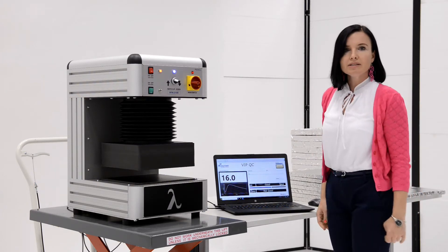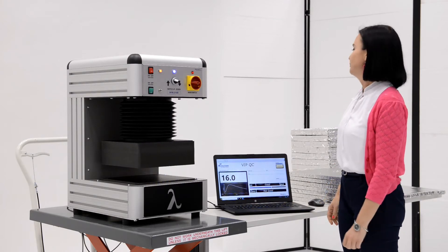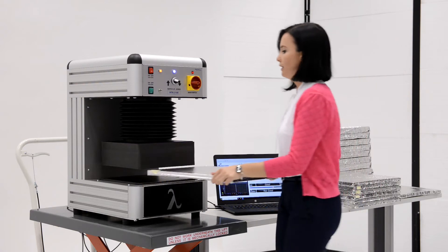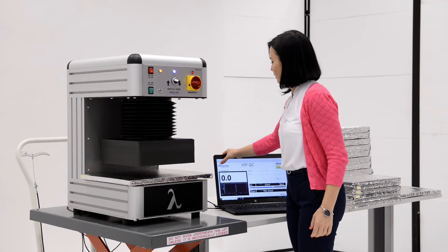Then we will start testing a series of samples prepared before. We take the first vacuum insulation panel, insert it, and run the program.